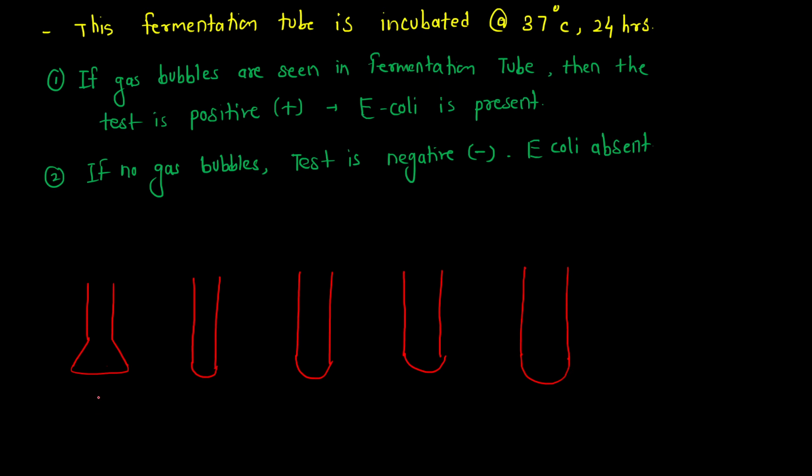So now pay attention. Initially we will be taking the original sample of water, and this is a 10 ml sample. Now from this 10 ml sample, we will put 1 ml in the next tube. So this will be called a 1 ml sample.